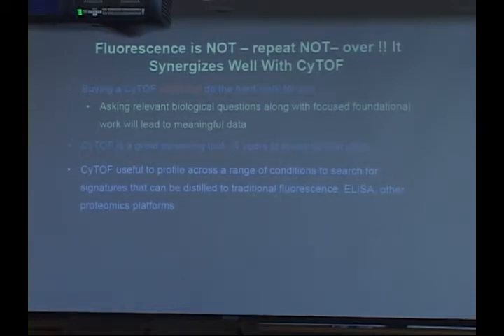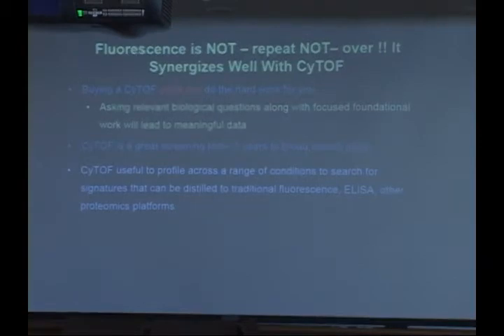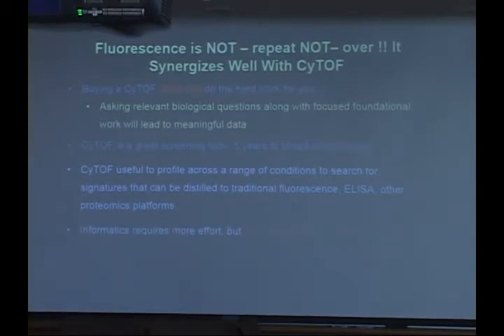You can look at your biological landscape and then hone in on things. People ask a lot, I get asked about whether this is going to be in the clinic. I'd say not yet. It's certainly not an FDA-approved instrument. After you've looked at your landscape, you can now focus in. The informatics, we have multiple approaches. You're going to hear about some, lots more effort. But the knowledge gain is just amazing when you've figured out that everything is technically sound, and then you get your data. It's a pretty great feeling.